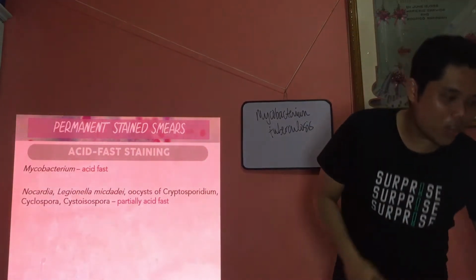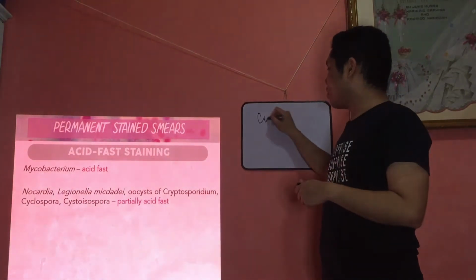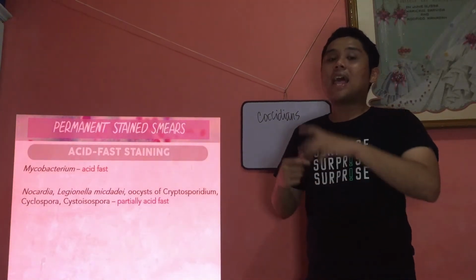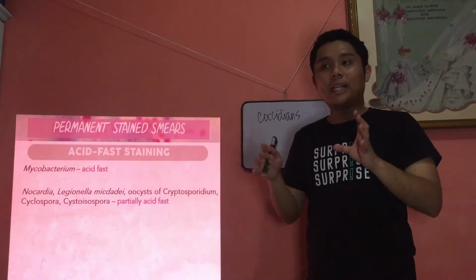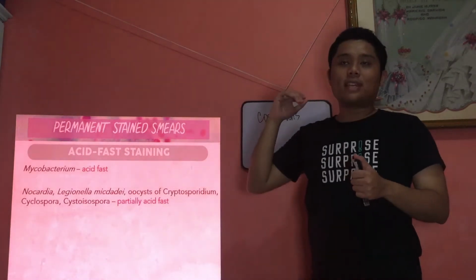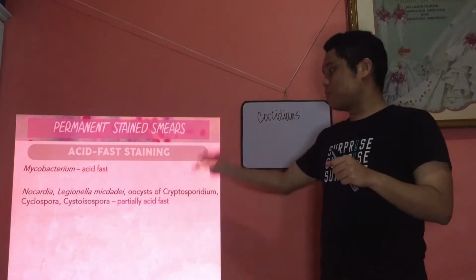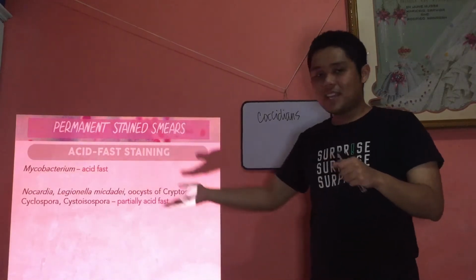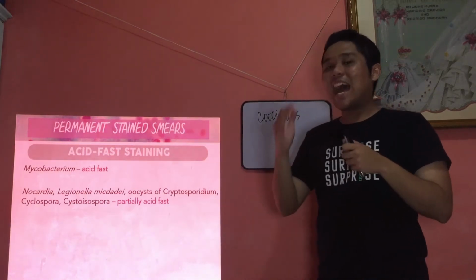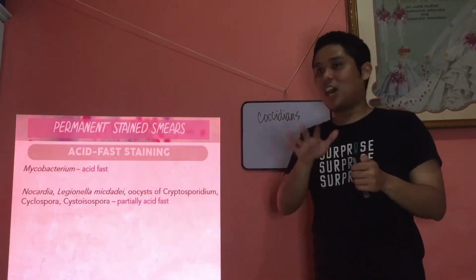The coccidians, still protozoans, are what we call partially acid fast. When we say partially acid fast, they have long chain fatty acids in their cell wall, but in much lesser content compared to Mycobacterium tuberculosis or Mycobacterium species, which really have a lot of long chain fatty acids. These organisms here are parasites, very important, and that's where we come into the picture. They have long chain fatty acids in their cell walls, but in much lesser content.